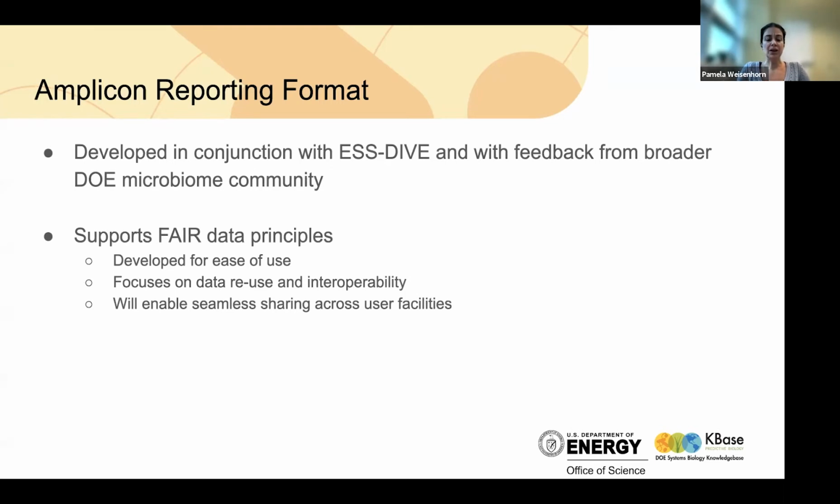We've really focused on supporting data reuse and interoperability. We designed this across different platforms so that there would be an ease of use and you can transfer data across systems. That was very important to us. And also, we really tried to focus on the metadata that was most critical for understanding whether or not you can use two different data sets together. So that is really the focus.